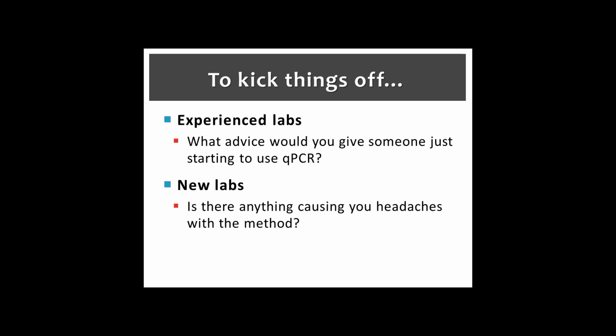You're going to start monitoring, because you've already proven and you have confidence in your standard curves. They make sense. You've got a spike sample from MSU and you've got results that made sense. So now we have to believe that you can keep running. But there are some things you can do in the lab to make sure that you still gain that confidence. You want to explain how you keep running the positives and negatives in each run?